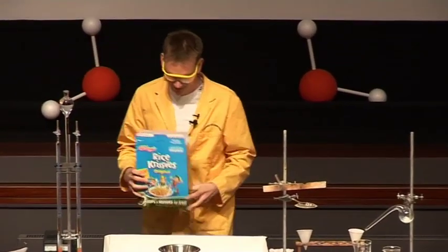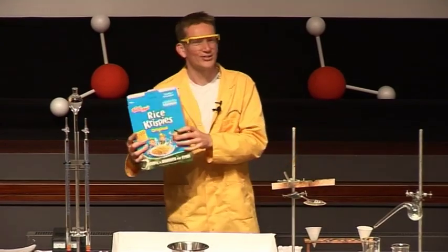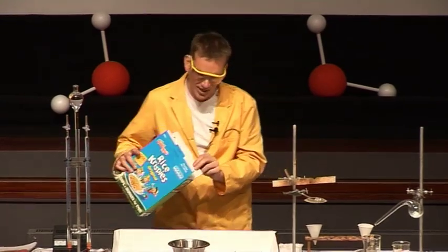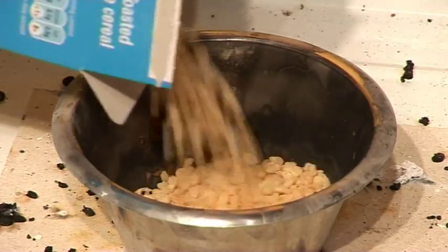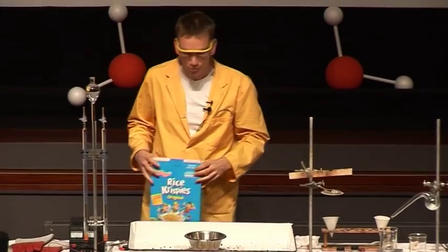This is with some Rice Krispies. If any of you have seen some of my other lectures, you may have seen when I'm reacting Rice Krispies with oxygen in the form of liquid oxygen, and then we light it with a stick, and the Rice Krispies go up quite drastically. Well, this lecture, of course, is all about water, so I'm going to start this reaction with a drop of water.